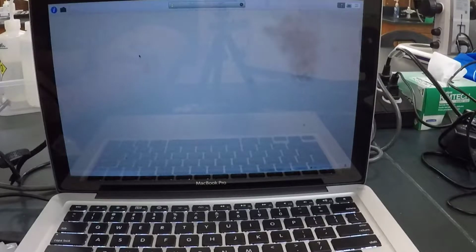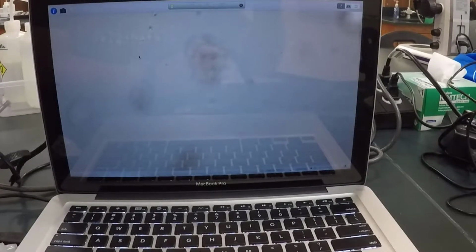Okay, and I'll come back after I find some more. I'm looking for an amoeba. There goes, you can just see some things shooting through the screen. That happens quite often. You just got to capture them. But I'll bring it back when I find something that's different than paramecium.